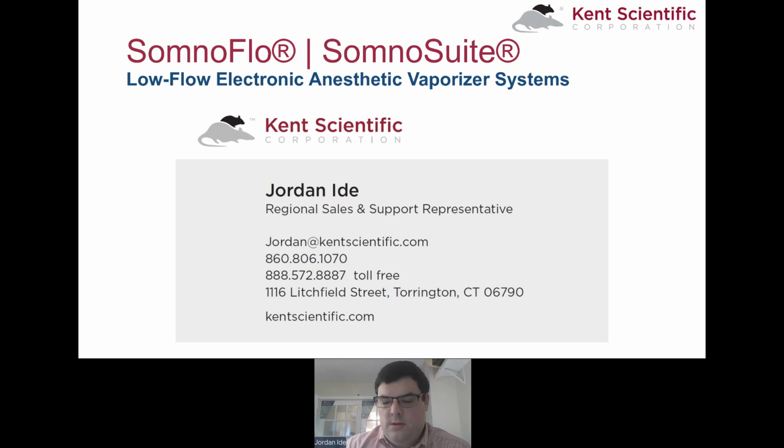We have another question asking what the largest animal can be anesthetized using the Somno Flow. If we're trying to anesthetize rats, would we have greater success with supplemental oxygen? Sure. So the largest animal weight the system can use, both the Somno Suite and Somno Flow, is 1.2 kilograms. This varies a little bit if you're using a stereotaxic stand.